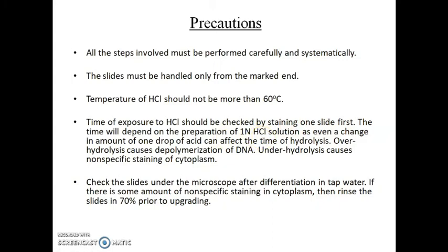Over-hydrolysis causes depolymerization of DNA, and under-hydrolysis will cause non-specific staining of the cytoplasm. Check the slides under the microscope after differentiation in tap water. If there is some amount of non-specific staining in the cytoplasm, then rinse the slide in 70% alcohol prior to upgrading.